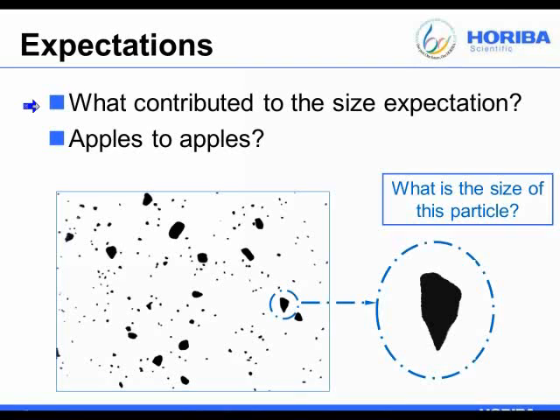Sometimes it's coming because of hope, right? We hope we have nanoparticles, so when we see a result that isn't nano-sized, we want to understand why that is.